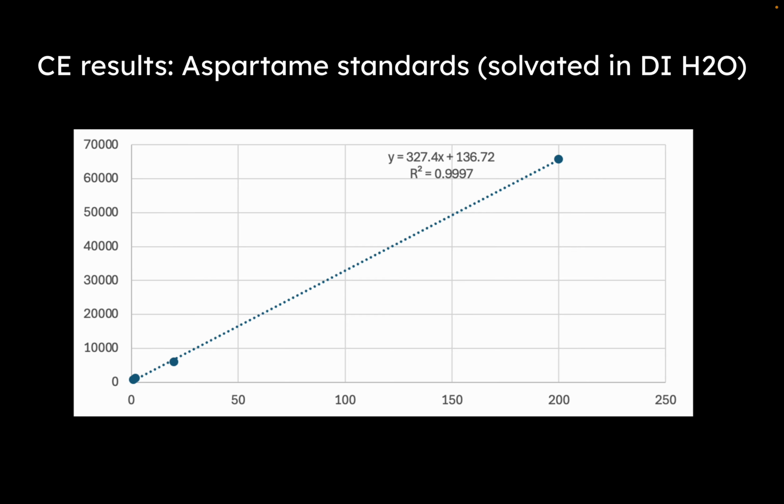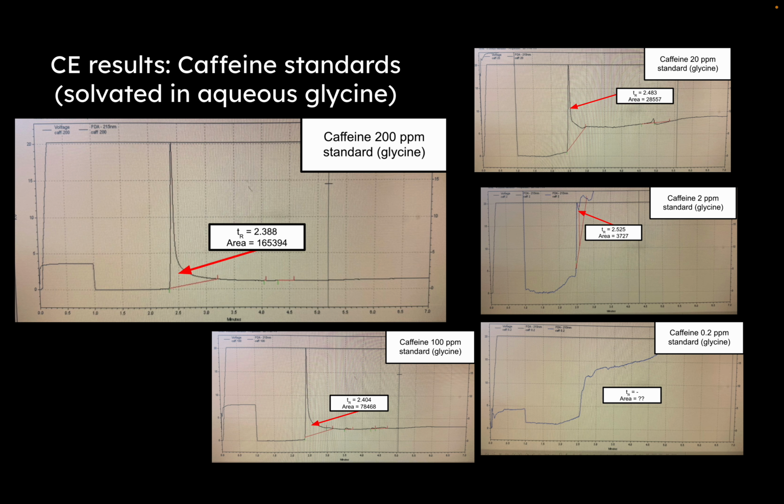Okay, so this is the calibration curve I generated. It wasn't great. And none of the DI water standards were great, but I did use them in my first analysis, which we'll see.